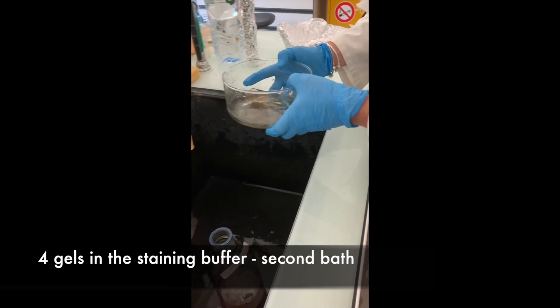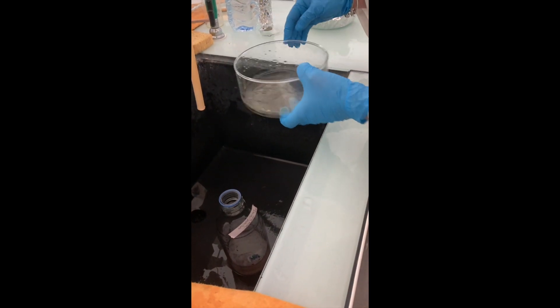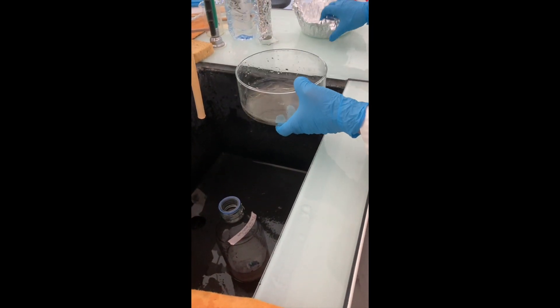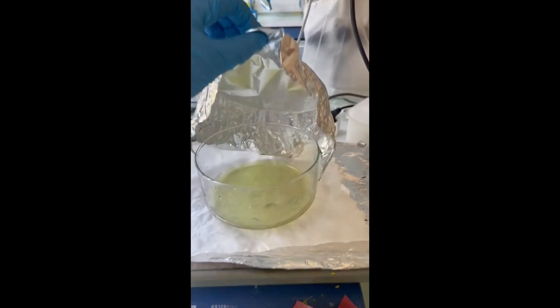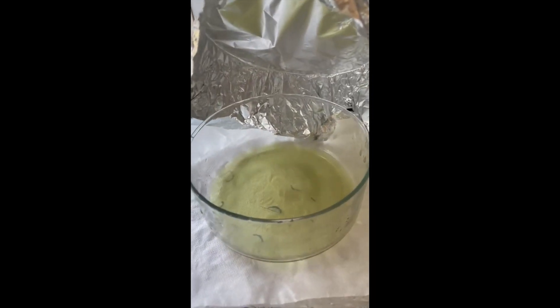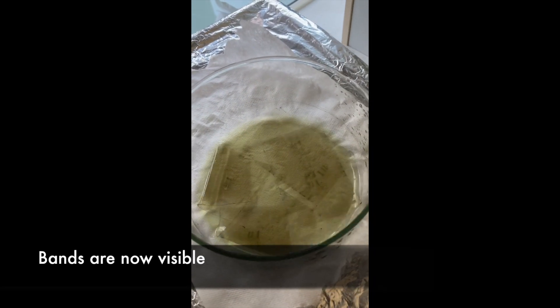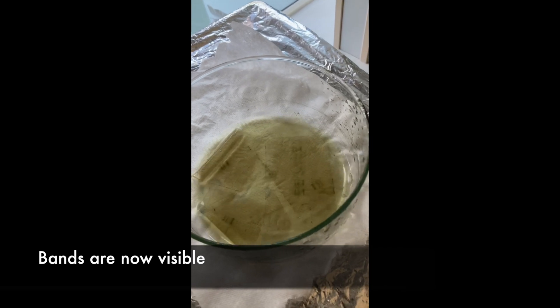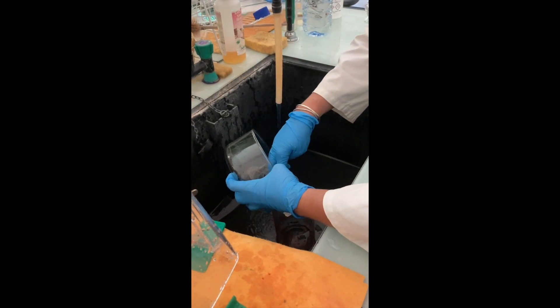The gels are shaken once again in the buffer for a second bath. The bands are now visible; when the bands are sufficiently visible, the gels are rinsed once again.